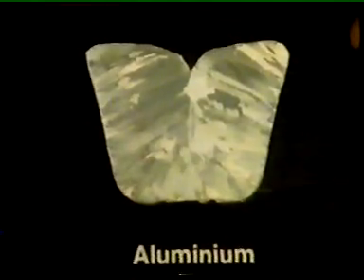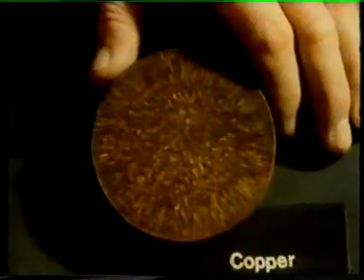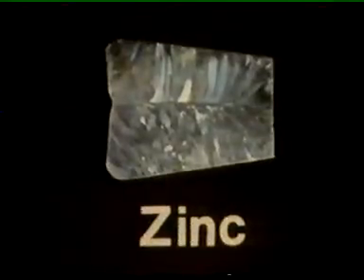Here's a different sample of aluminium. In this case, the grains are much larger and they vary in size. And here's a piece of copper. In this sample, the grains seem to get smaller as you get nearer the middle. Zinc, a sample whose grains are all shapes and sizes.